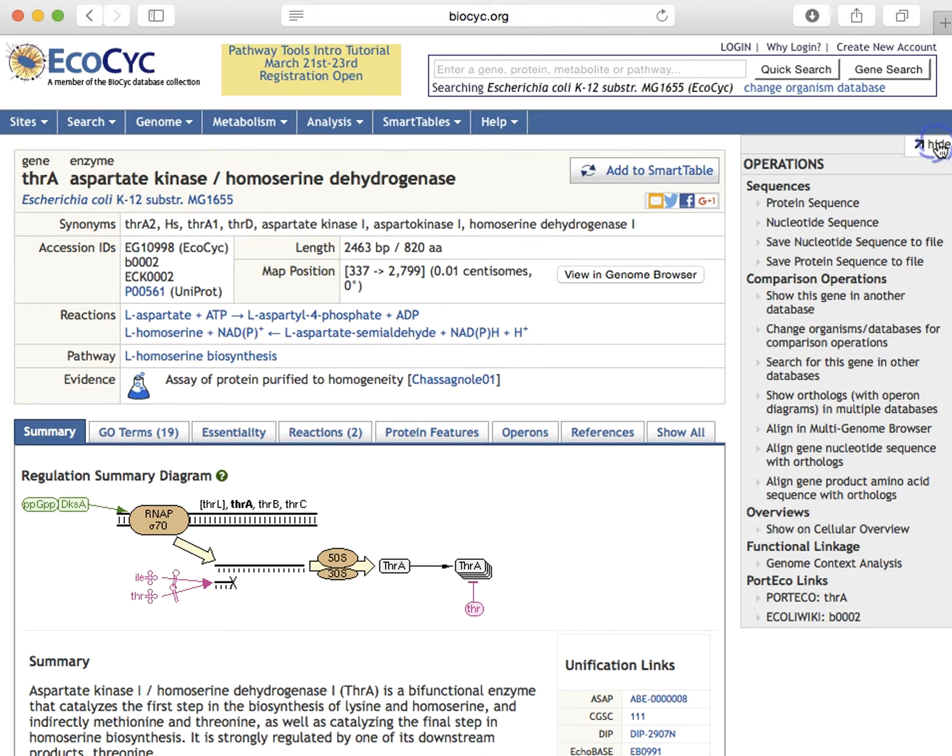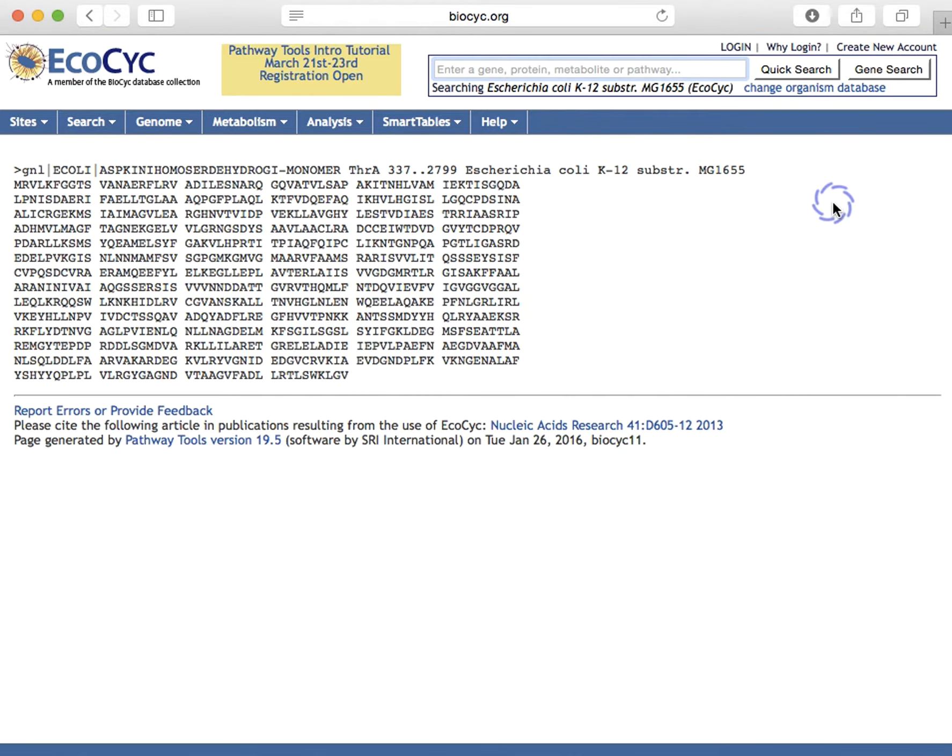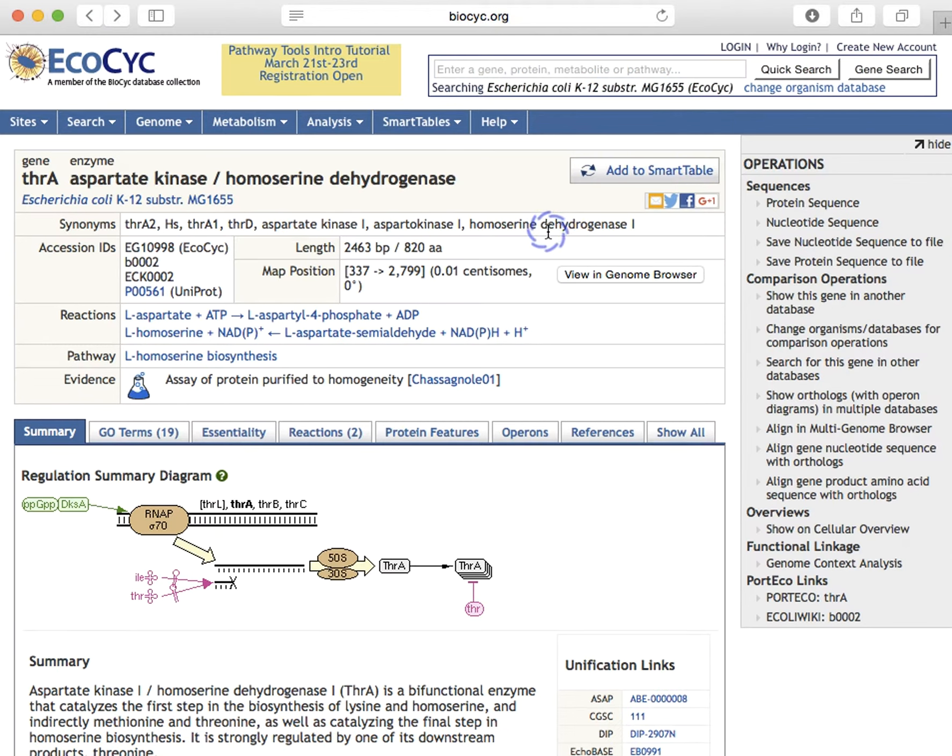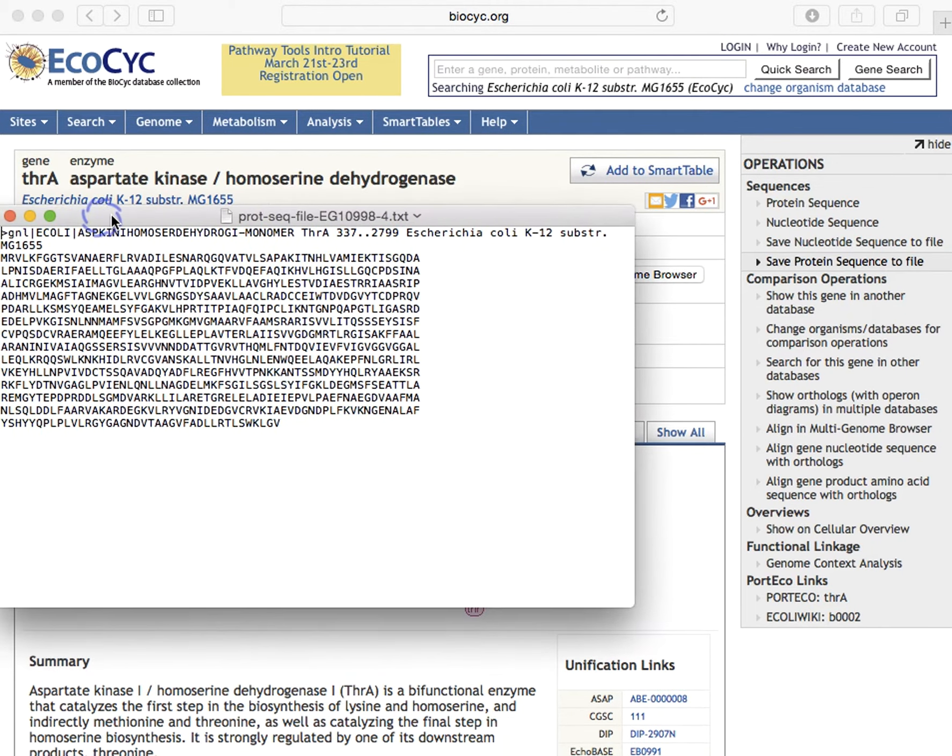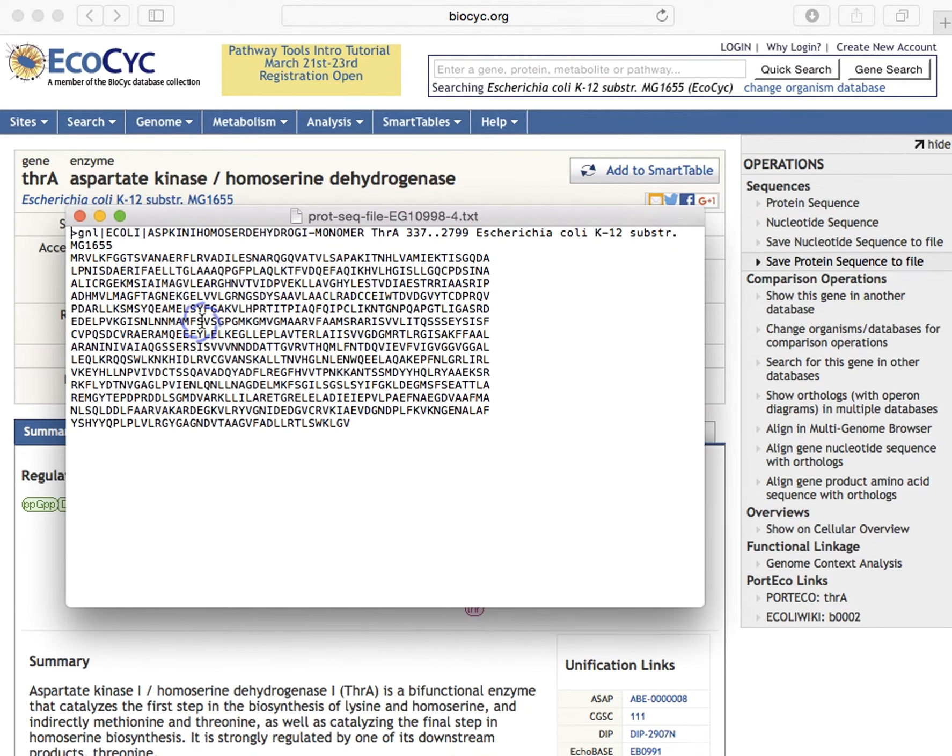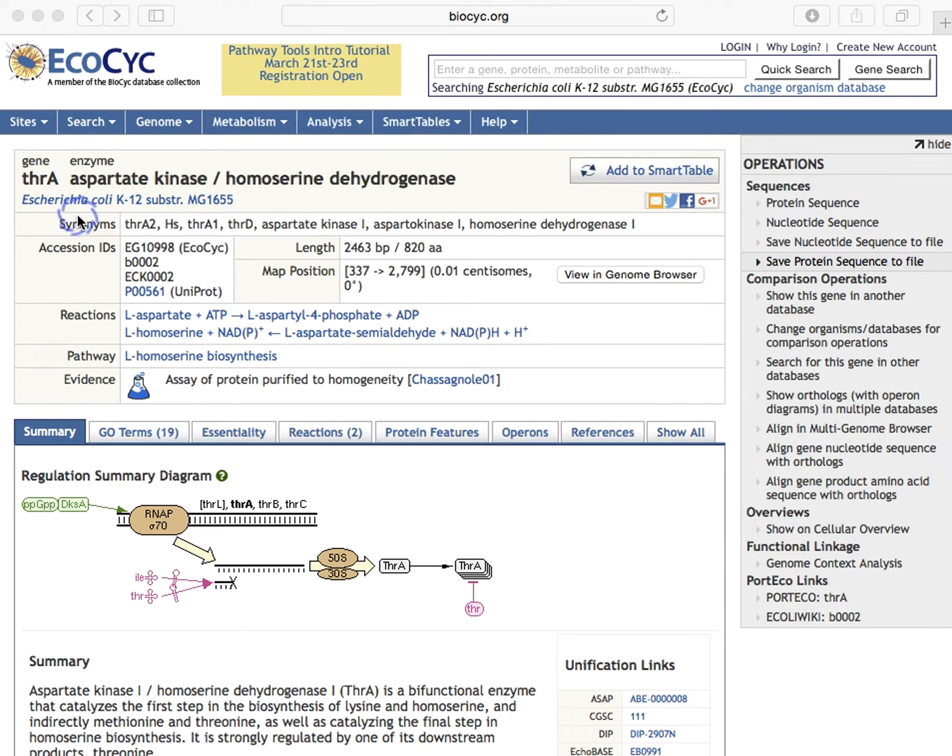To obtain the amino acid sequence of the THRA gene product, we simply click protein sequence, and the sequence is shown here. To save the sequence to a file, we click save protein sequence to file, and it has saved the file, and then opened that file in text edit on my Mac.